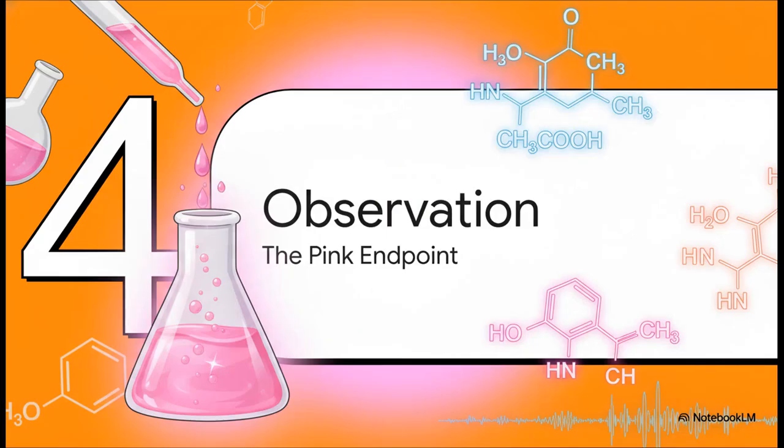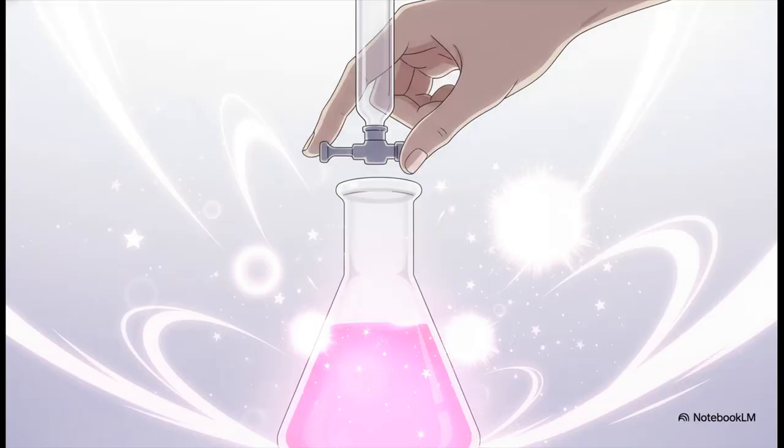Section 4, observation, the pink endpoint. Boom! The equivalence point. One single drop hits that swirling liquid, and suddenly, a faint pink flash. And it persists for at least 10 seconds. This is the magic of phenolphthalein. It turns clear in acid, but pink in a basic solution. So that color change is our undeniable signal. It means every single molecule of acetic acid has been neutralized, and that very first drop of excess sodium hydroxide has tipped the whole flask basic. The titration is officially complete, and we immediately record our final burette volume.